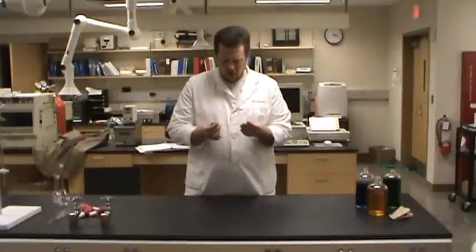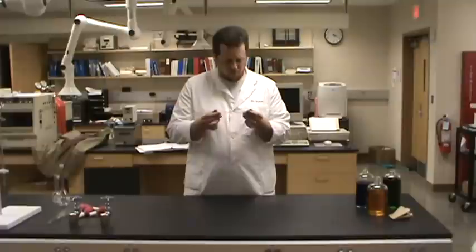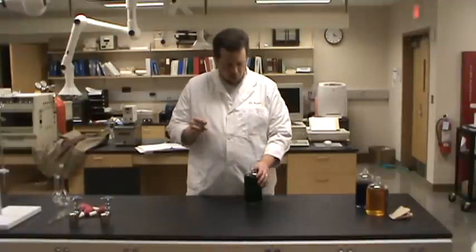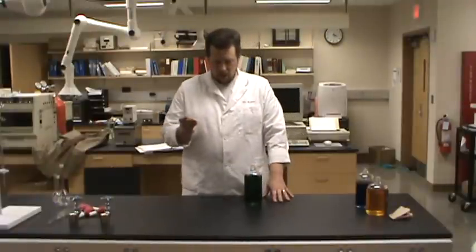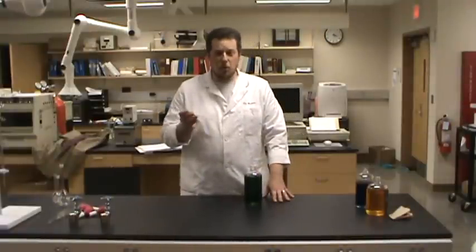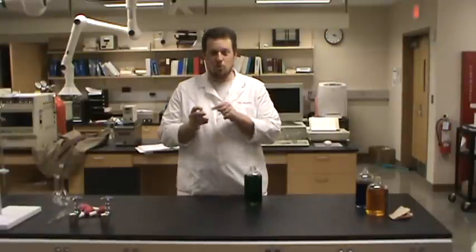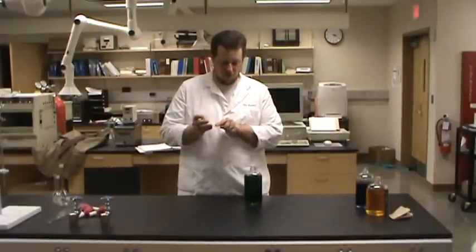Now for the hard part. How do we use this thing? Well, first of all, let's go with green. Probably the most important thing that you can do is remember how not to use this. So first of all, this never goes into a big stock bottle.